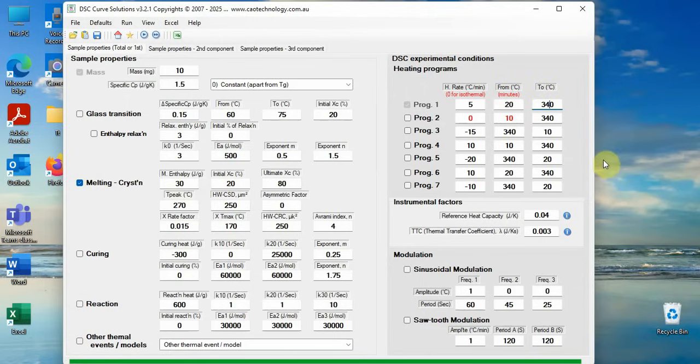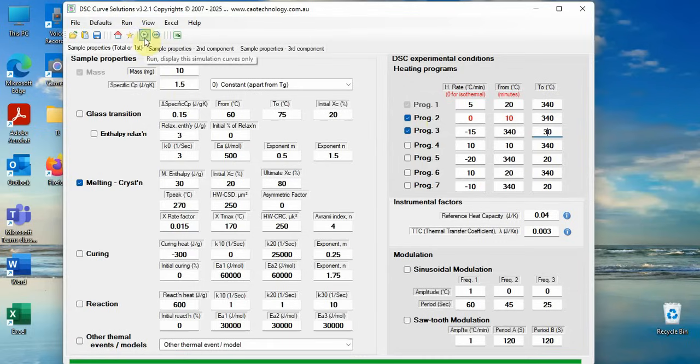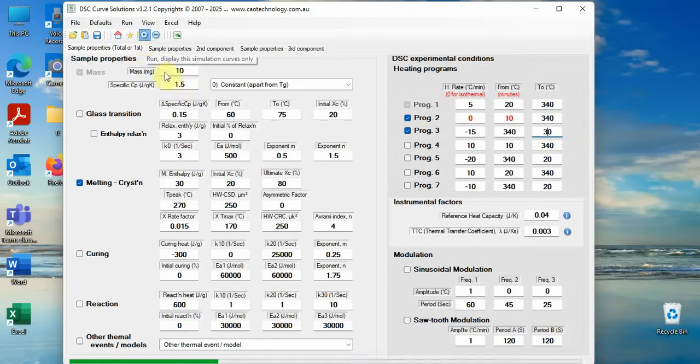We then run DSC at 5k per minute for 20 to 340 degrees centigrade, keep 10 minutes isothermal at 340 degrees centigrade, then drop temperature to 30 degrees centigrade at 15k per minute. Click button run. DSC curve is displayed.